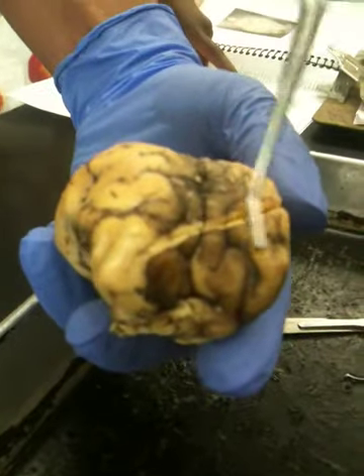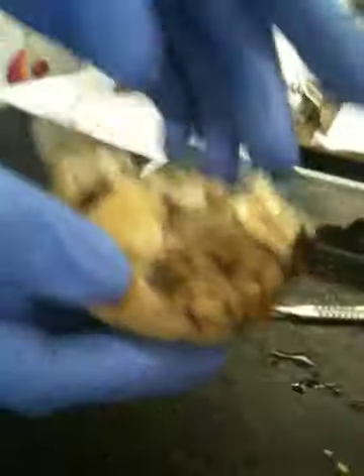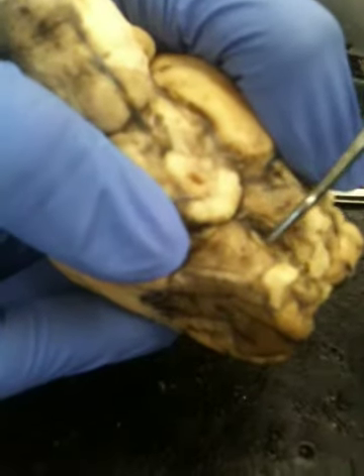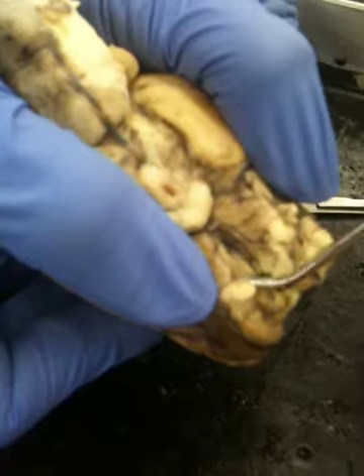What else do we have here? We have the olfactory bulbs. Excuse me while I flip this so you can see. Bulbs and tract. That's the tract. And if you look carefully, you can see the tiny little bulbs right at the end there.